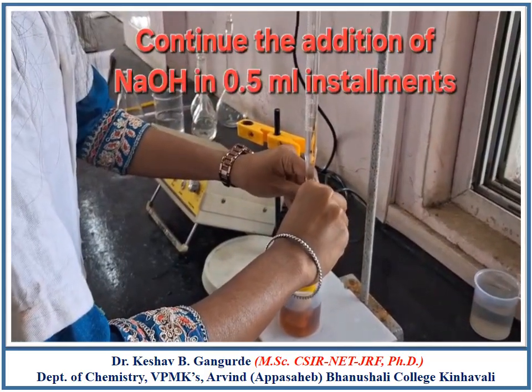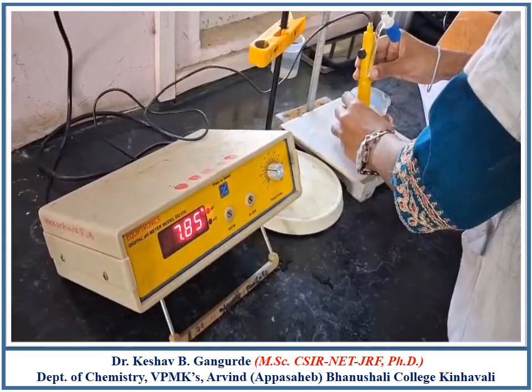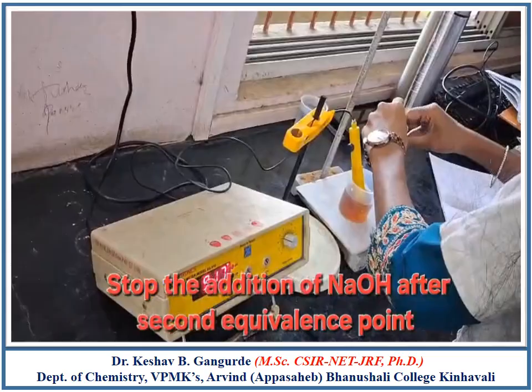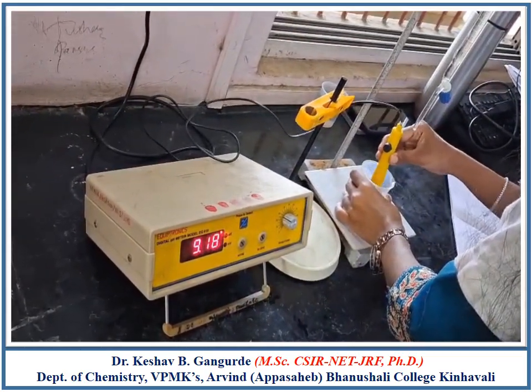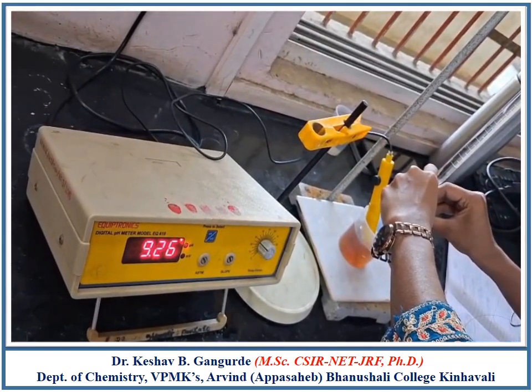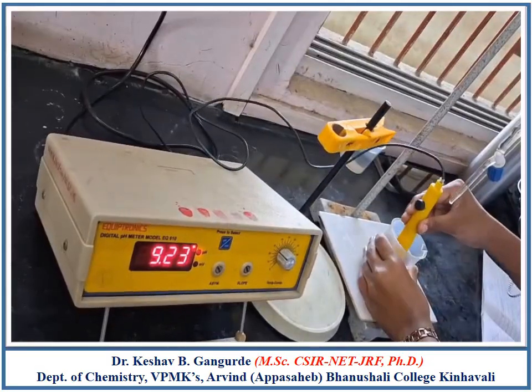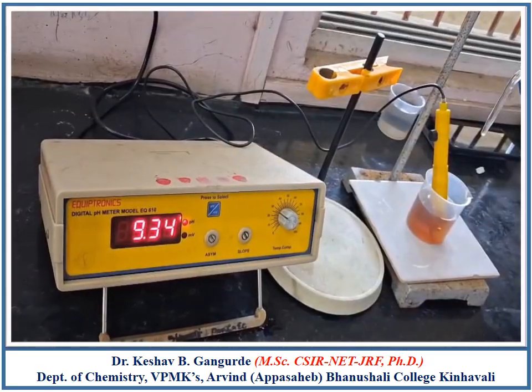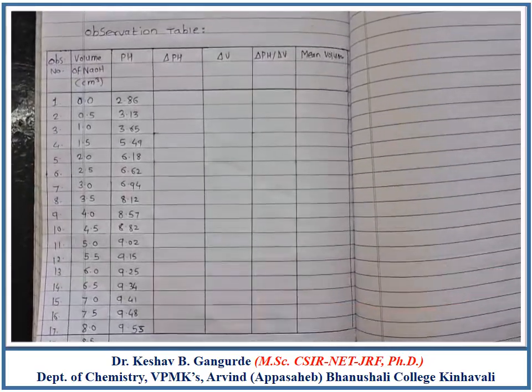Continue the addition of NaOH in 0.5 ml installments till we get 2 equivalence points. Note down all the readings in the observation table.